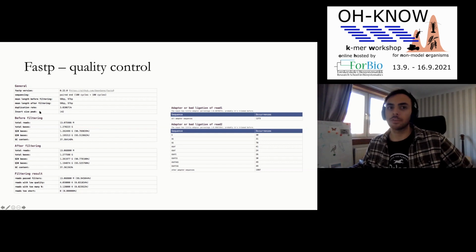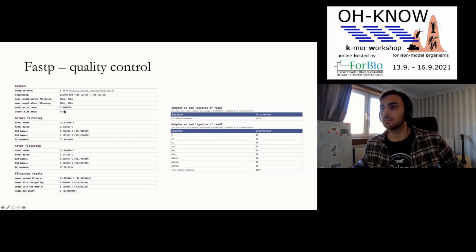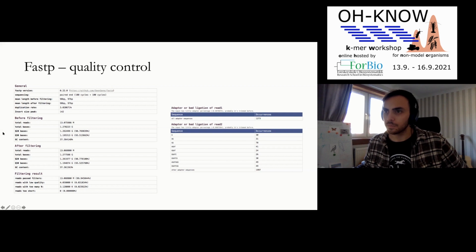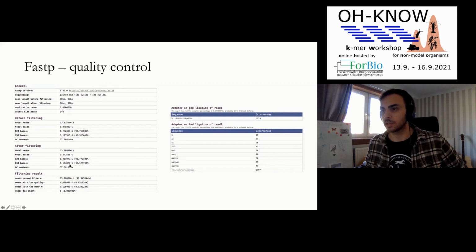Fastp will give you this general overview of your sequence information, things like mean read length. It will give you the insert size peak, so the mean distance between your reads in your paired-end library. It will tell you the kind of sequencing that you did, in case you've forgotten at this point. And it will give you some overview of what the quality of these bases looks like, and it will even tell you how much it improved it.